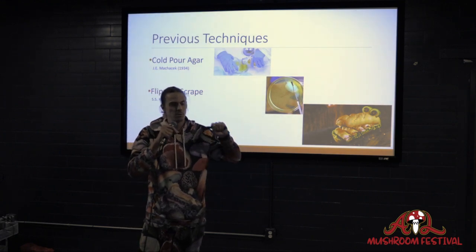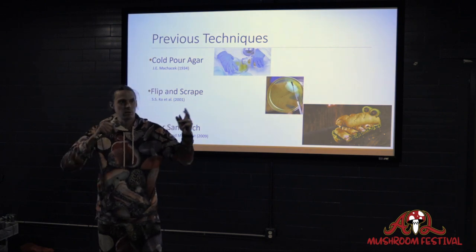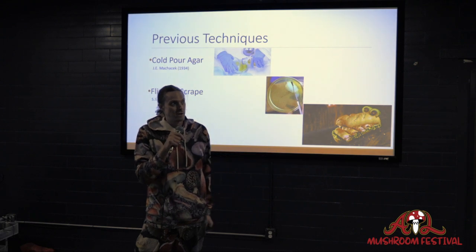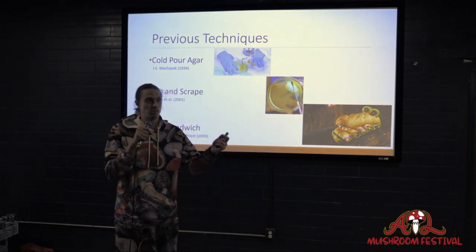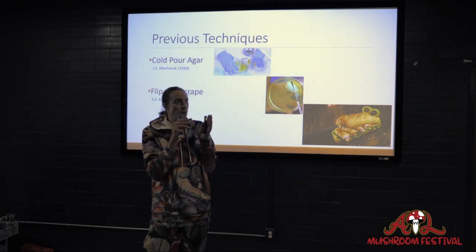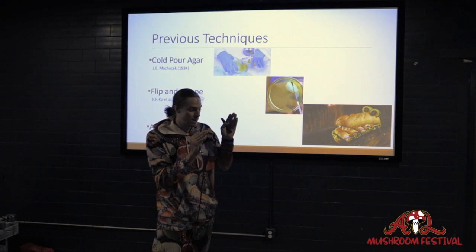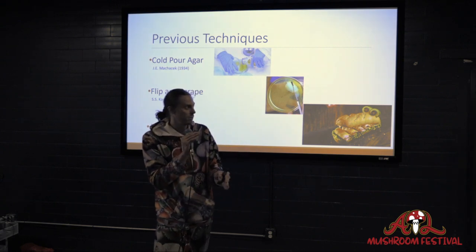And then from there, he was able to get clean cultures. The problem with that is obvious: it's very hard to tell when the agar is cold enough, right? It's kind of subjective without having a thermometer. And even if you did have a thermometer, you have a very small window. It is a very, very tight window between, okay, it's not that hot and I can stick this in there, and then it's solid, like a rock.